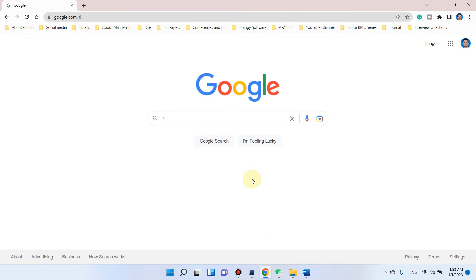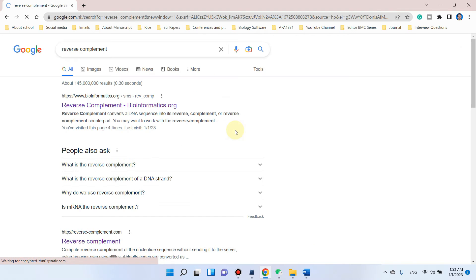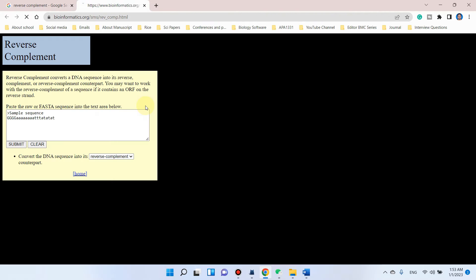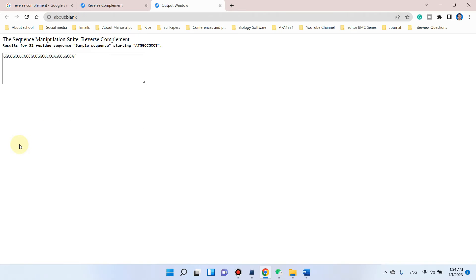Open Google and search for 'reverse complement'. Click on the first link, and you can paste your sequence which you copied from that file. Then simply click on Submit.